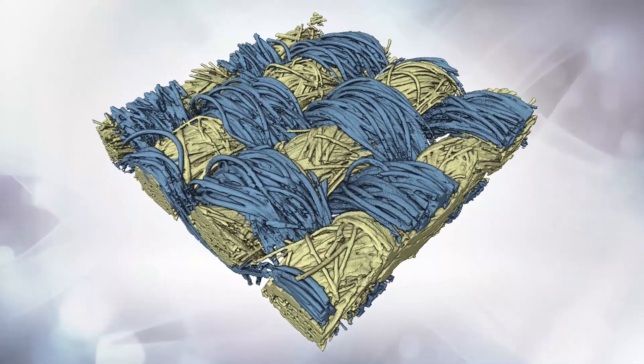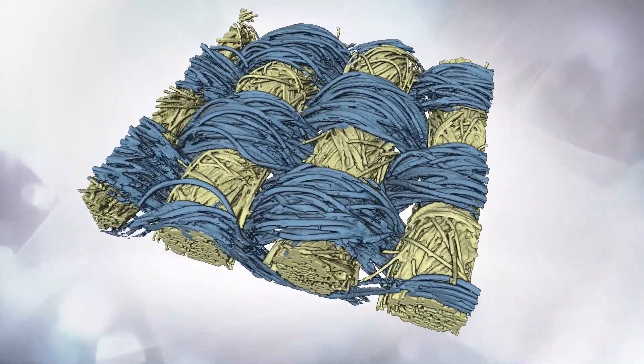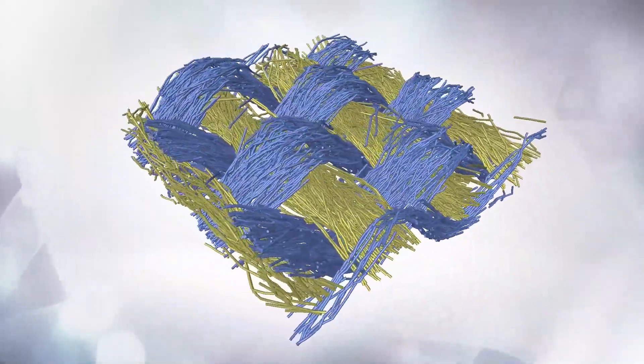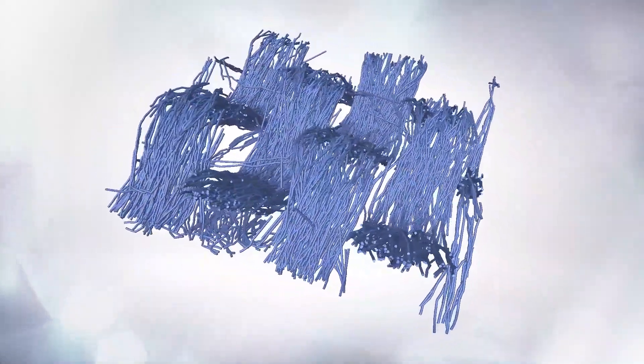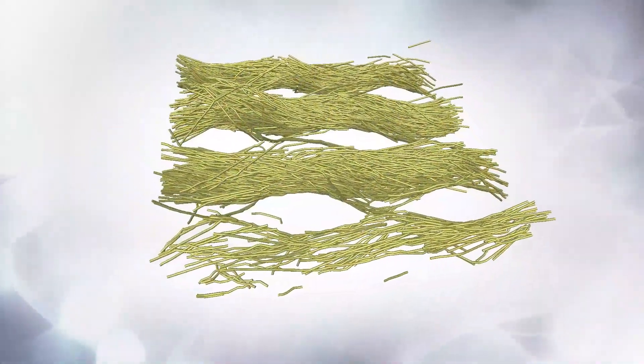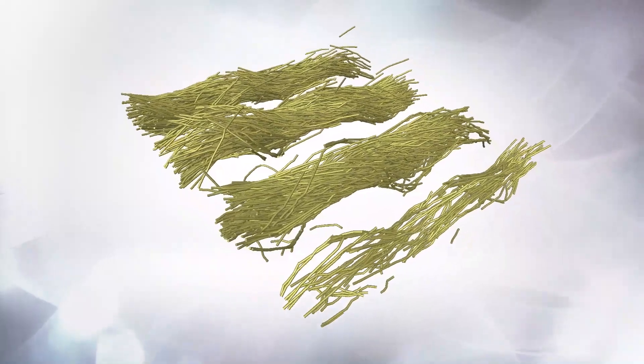Probably my favorite features within Aviso are the segmentation tools. When we're doing CT analysis, a lot of steps take a long time. However, segmentation is the one thing that users find very difficult to do, and it's also the one thing which all our analysis hinges around—how good our segmentation is.